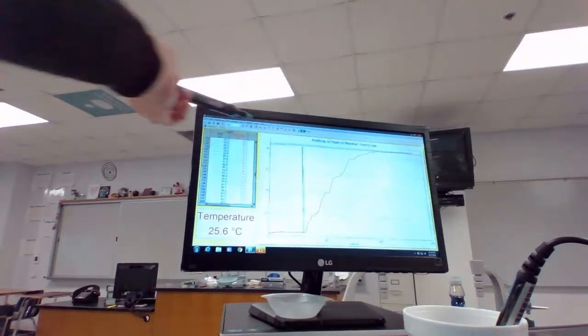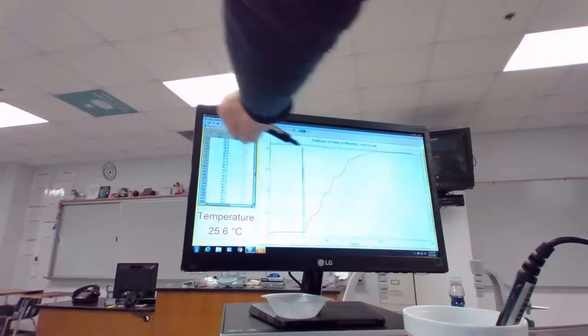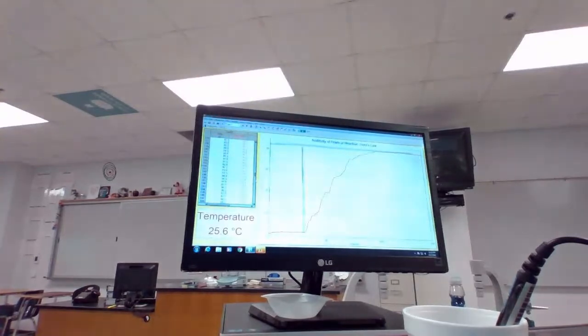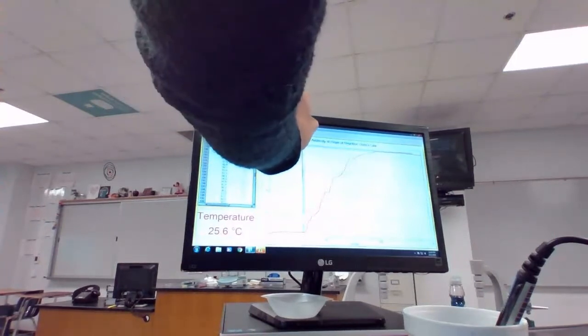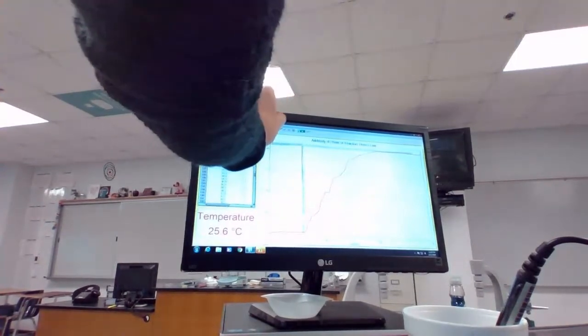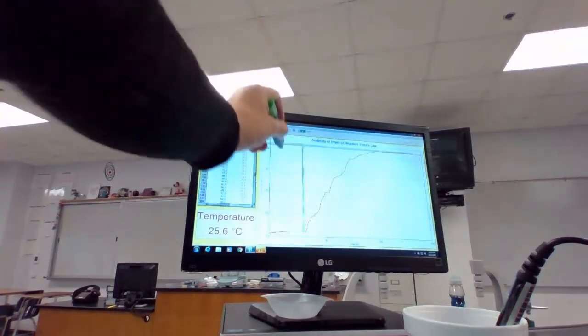But if there had been a lot more heat that was released, then this parallel would have been down like this, and we would have been up higher here. So this intersection right here would tell us the actual point right there. And that still looks like that's at 29.6. So again, we're going to do the calculation.